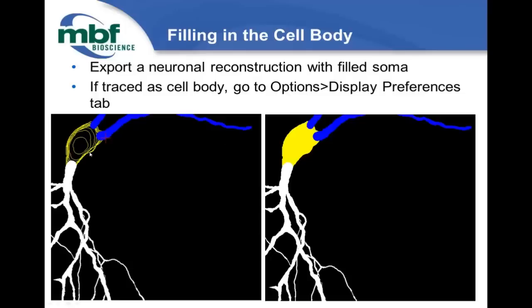If you traced the soma as contours, use the Editing tool (Edit > Select Objects), draw a marquee around those contours, right-click, and select Set to Cell Body. Then when you go to Options > Display Preferences and enable fill, you'll see a nice solid structure. A handy trick: set your display preference to fill cell bodies by default so you can immediately tell when you load a reconstruction whether contours need to be changed to a cell body.